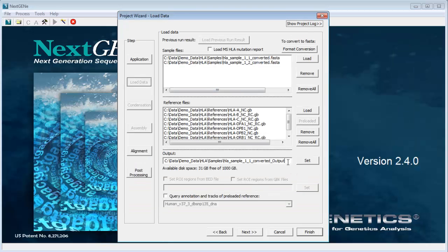Under Output, you can leave the default location or modify as needed. Then click Next.